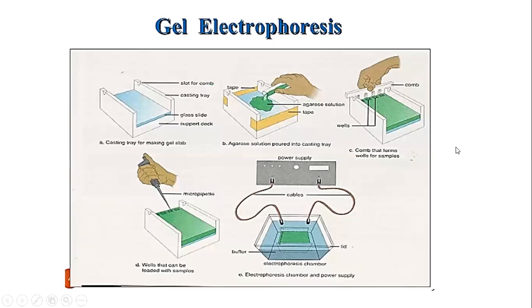Basically, gel electrophoresis is one of the most used product purification techniques by which we can generally separate proteins and nucleic acids, and these are used in a huge manner, so that the proteins that are present in a clump may be purified and separated.